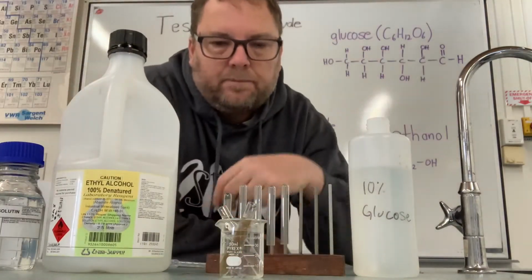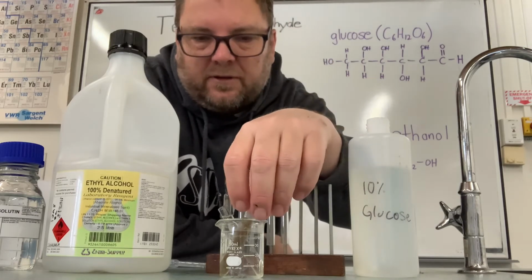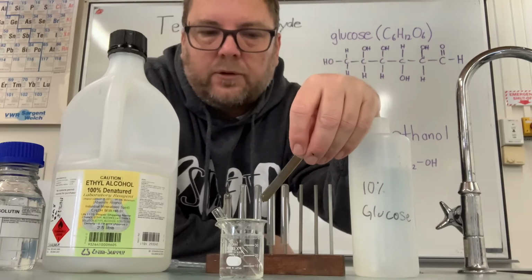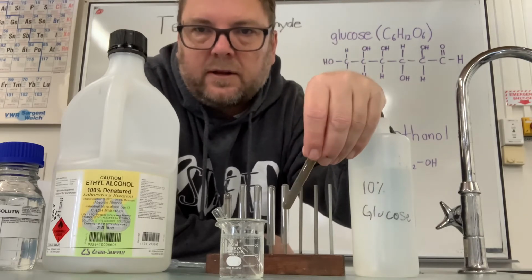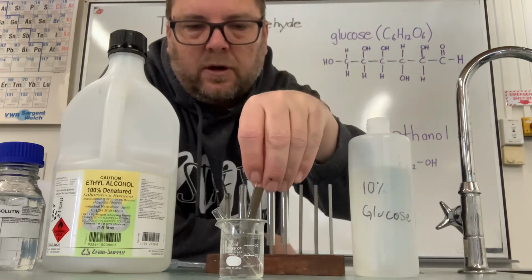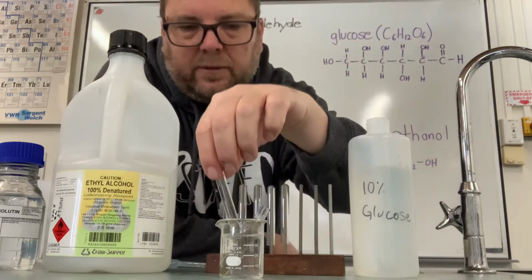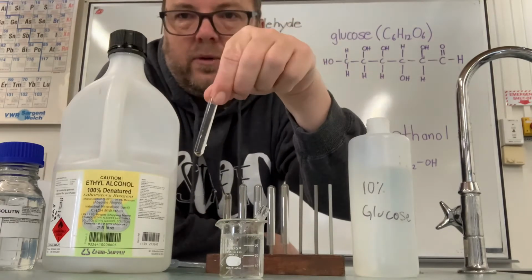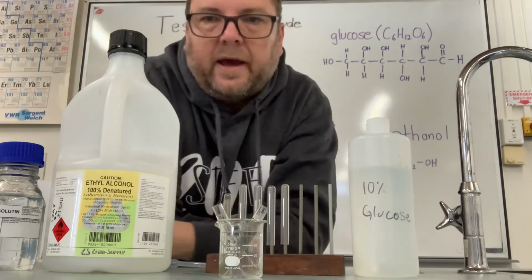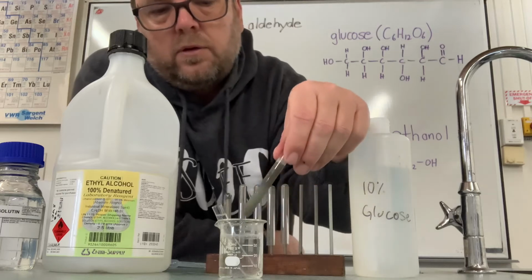Okay, so I've only just put these into hot water. What you can initially see is this one here on this side. We're starting to see this brown. We're almost seeing that silver color forming in the middle of that one, but it will take a little bit longer. So that was the one with the glucose, and this one here that came from the ethanol. We haven't really seen any change from yet.